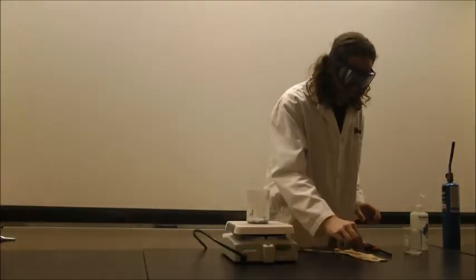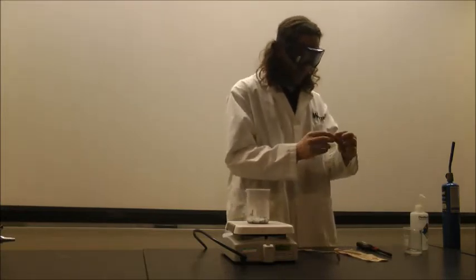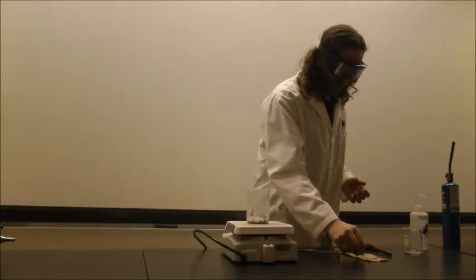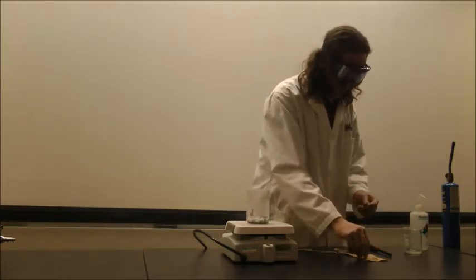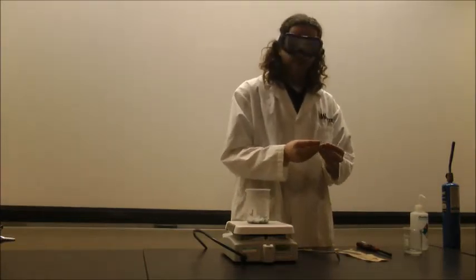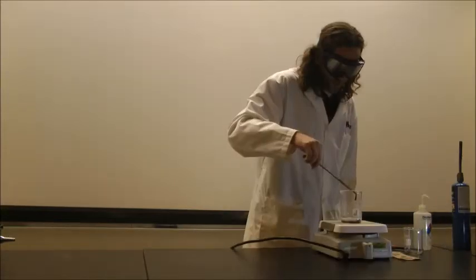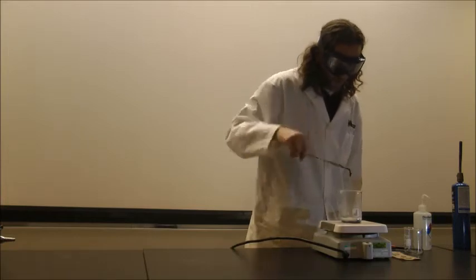But we all know that it's not possible to turn copper into gold. If it were, gold would no longer be precious, right? No one would be yearning after gold if you could just make it out of copper by putting it into a simple solution and then heating it. So I'm going to try this again, get a little more on there.